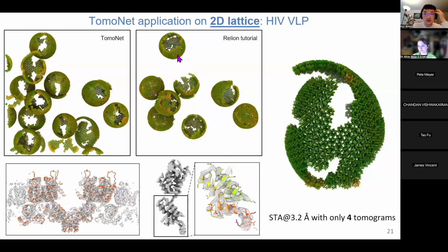Basically, you can put your raw tomograms together with them, and in this case, by directly overlapping the placed-back structure on the density, I can see whether all the artifacts or defects are real there.